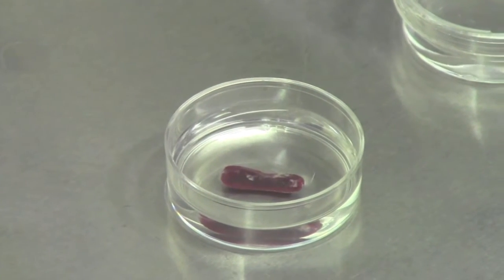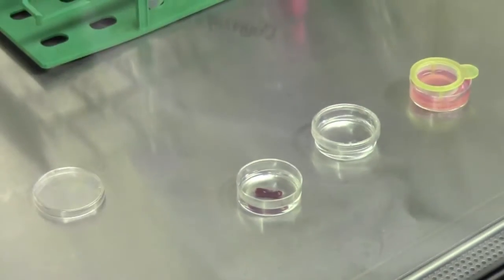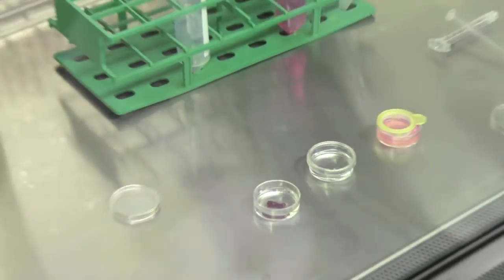First, the spleen is dissociated from a mouse and is placed into a petri dish filled with phosphate buffered saline, or PBS, in order to keep the spleen hydrated.